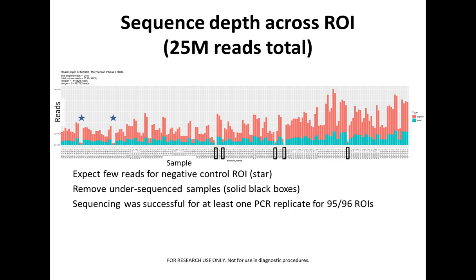I want to show you the sequencing stats across these different ROIs. We had a total of 25 million reads. On the x-axis are all the different ROIs, and on the y-axis are the read counts. The two stars are the negative controls — we expect few reads there, as shown. Some ROIs marked with black boxes were under-sequenced samples and were excluded. In total, sequencing was successful for at least one of the PCR replicates for most ROIs — 95 out of 96 ROIs.